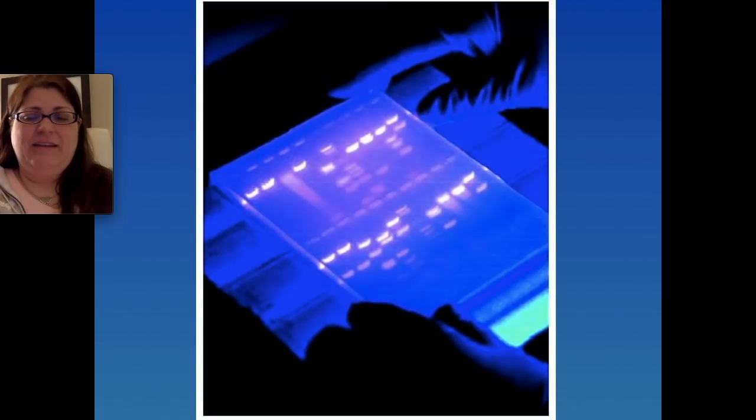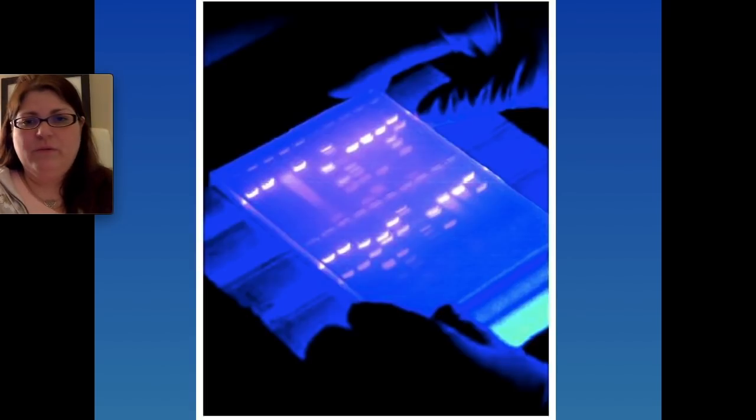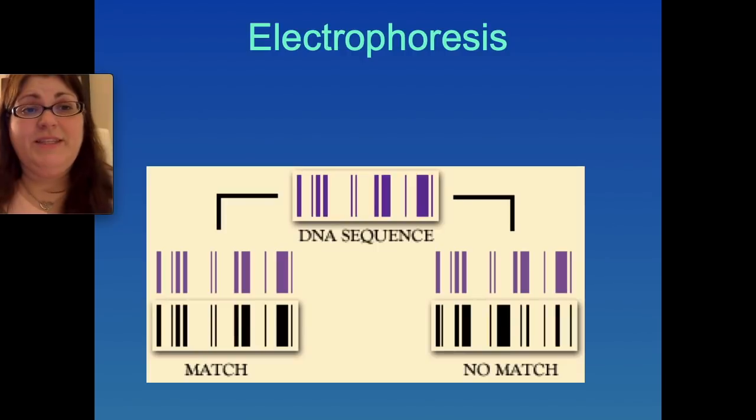Back in the day, and even still a lot of times today, it looks something like this. They use a UV light to see it with special dyes. Now, of course, they have computer-enhanced methods of doing this, but the old school method, which is still tried and true, is to analyze it using a picture to take a look at the actual dye images.